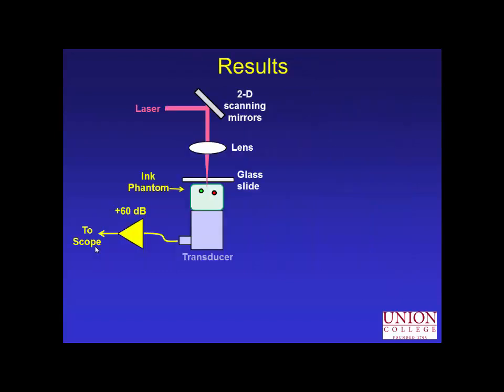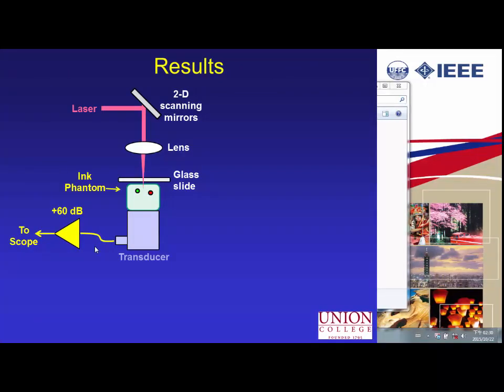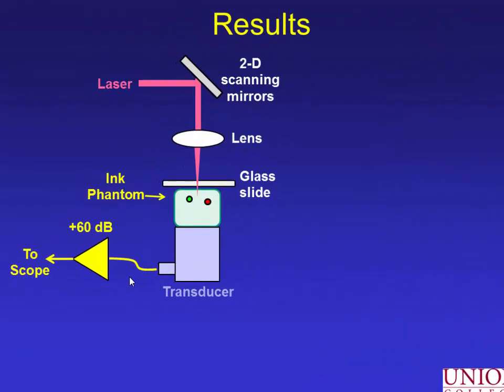As far as an actual photoacoustic experiment, this is the usual optical resolution photoacoustic microscopy system. We have scanning mirrors and we focus the beam into the sample. In this case, we just have dye-filled tubes, 250 micron inner diameter. Then we have a 25 megahertz transducer for detection and an amplifier. And as you scan the laser, you acquire your signals.